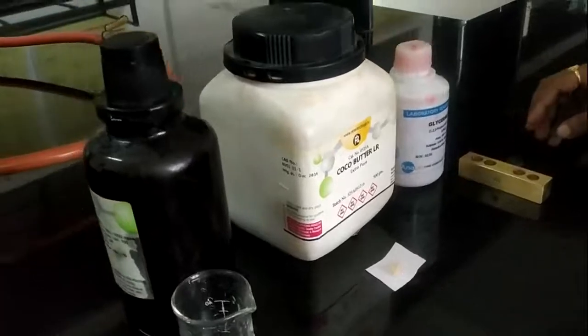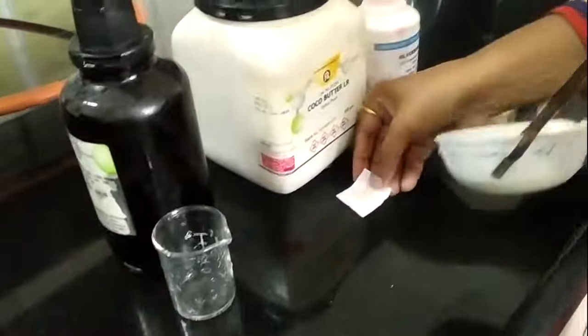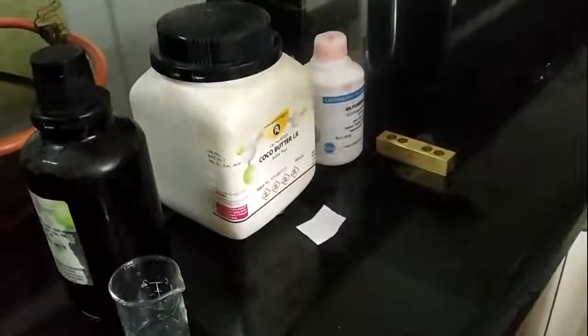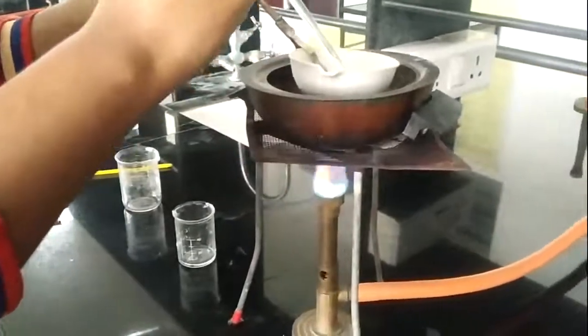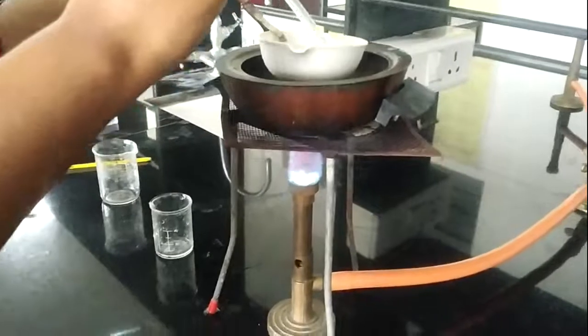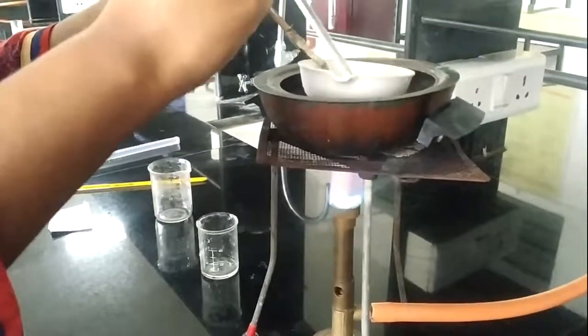So now first of all I am going to take this cocoa butter into this evaporating dish, and then we will proceed for heating it. Now I proceed for heating on the water bath to melt this cocoa butter.